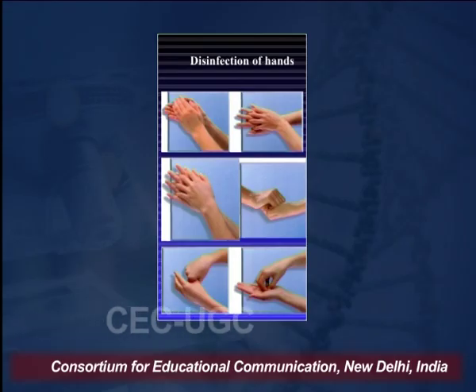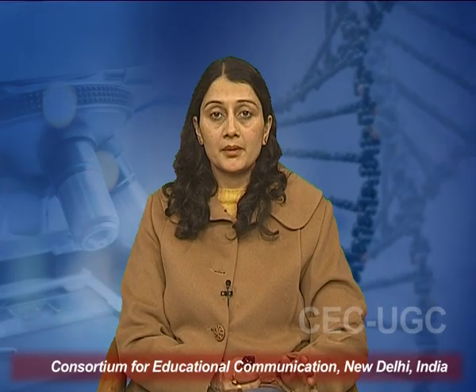The temperature is maintained at 37 degrees Celsius, humidity is maintained from 55 to 60 percent, and the growth is observed the next day. But before you start all these experiments, you have to make sure that your hands are clean. We are doing sterilization techniques today.